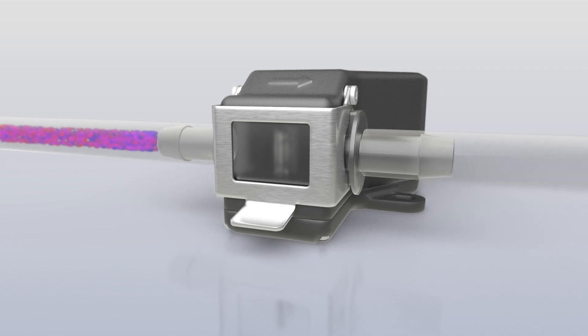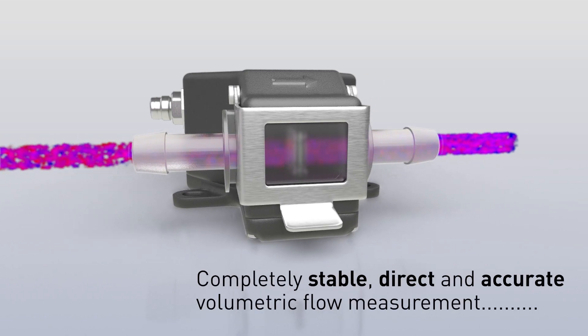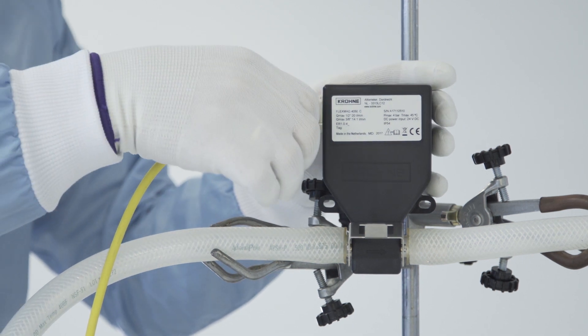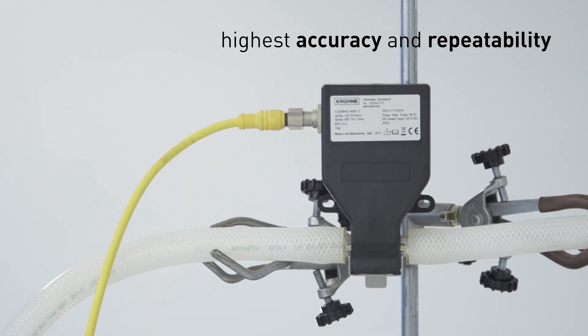As an electromagnetic flow meter, the measurement will not drift over time. It provides a completely stable, direct and accurate volumetric flow measurement which is unaffected by fluid properties such as viscosity or density. Due to the electromagnetic measurement principle, the highest accuracy and repeatability is achieved without the need for in-situ calibration.